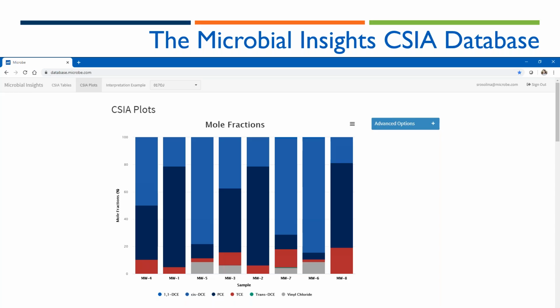And these alone, as many of you are already very aware, can be very useful for determining whether something might be degrading, whether background wells look very different from wells where you expect degradation to occur, or wells where you expect that degradation is stalling, for example. So visualization is extremely important for determining next steps at that crossroads.